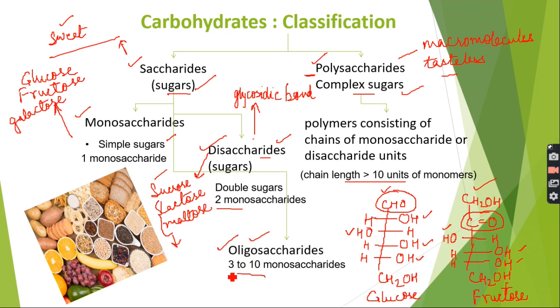We don't have an oligosaccharide in today's experiment, but there are many oligosaccharides which you can learn about in the theory, like raffinose and stachyose. The polysaccharide which we have provided as a sample today is starch.